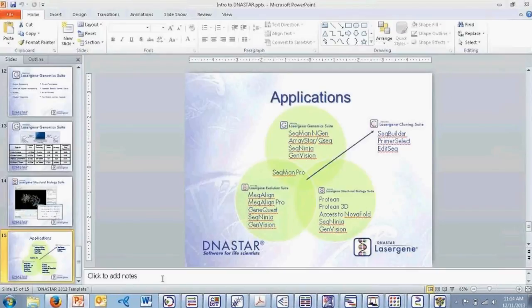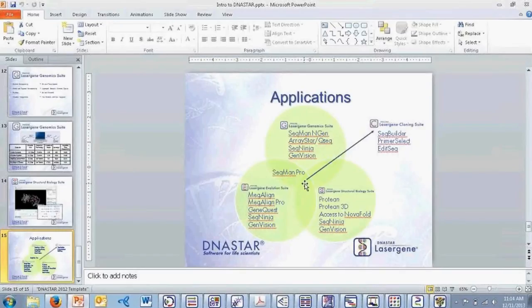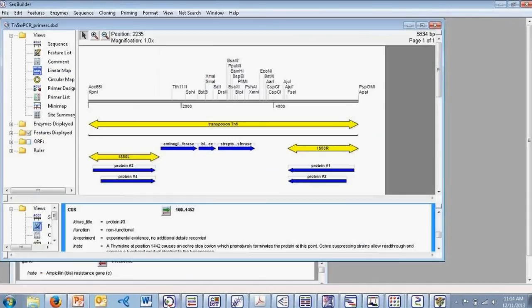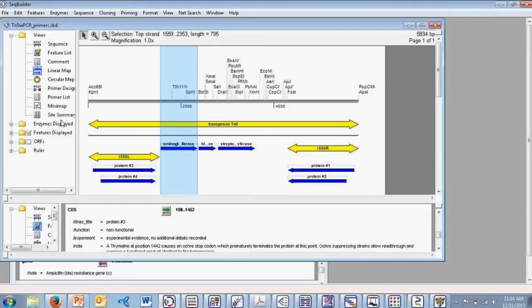The Navigator also features a help search function across all applications. You can click on any application within the Navigator to directly launch it. The first set of applications I'm going to introduce are the basic applications included within the LaserGene cloning suite. Keep in mind that these applications are also included in all of the larger suites as well. The first application in the cloning suite is our SeqBuilder application, which is our application for sequence editing and annotation, automated virtual cloning, and primer design.